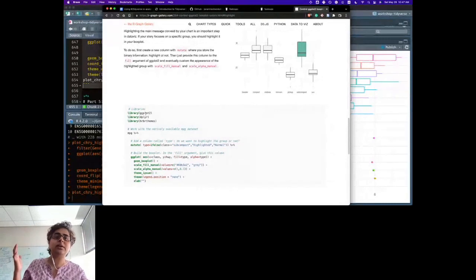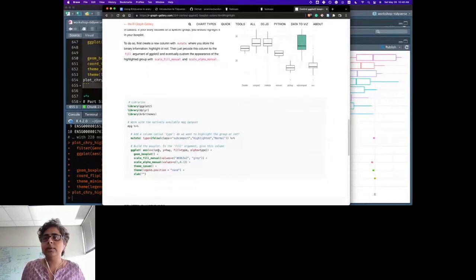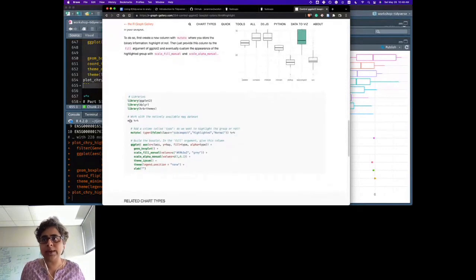You don't have to figure out every single thing. That's not hard either, because people have had your questions, your errors, at least thousands of times before. So that's the beautiful thing about the R community. There's tons of answers, tons of support there on Twitter, GitHub, Stack Overflow, and everywhere. So you can do your Google searches or your Stack Overflow searches. Just say R Tidyverse and your question, or R ggplot and your question, and most likely you'll have an answer. That is extremely helpful. Okay, so here you have example code. Now you know how to make sense of all of this, don't you? You know ggplot. What is the variable that it's working on?